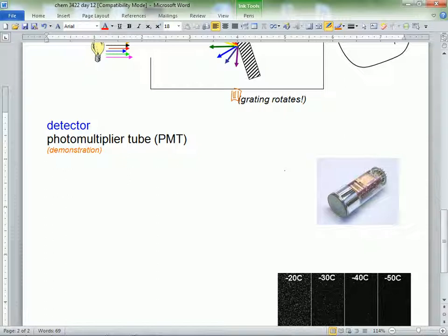I don't know if you can see this thing. Your cuvette or whatever is going to be right in here. The light has to strike that silvery, shiny surface. It's going to be really dark, so it's not very intense light at all, and it doesn't matter what wavelength either.